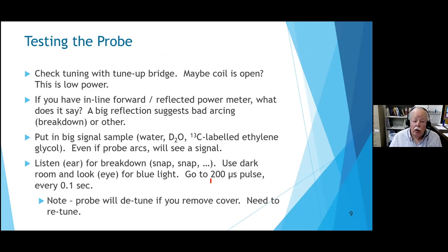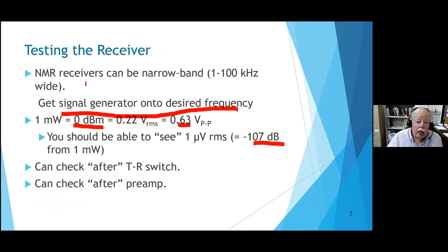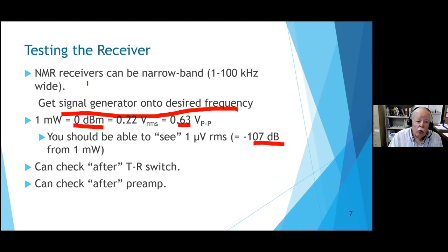Maybe the transmitter passed its test. I should have said: check the noise first. The easiest test of the receiver is - is the noise normal? Some of us work with signals so much bigger than noise that we never see it. When the system's working, turn up the gain and note how big the noise is. If the noise is way down, you probably lost a stage of amplification.